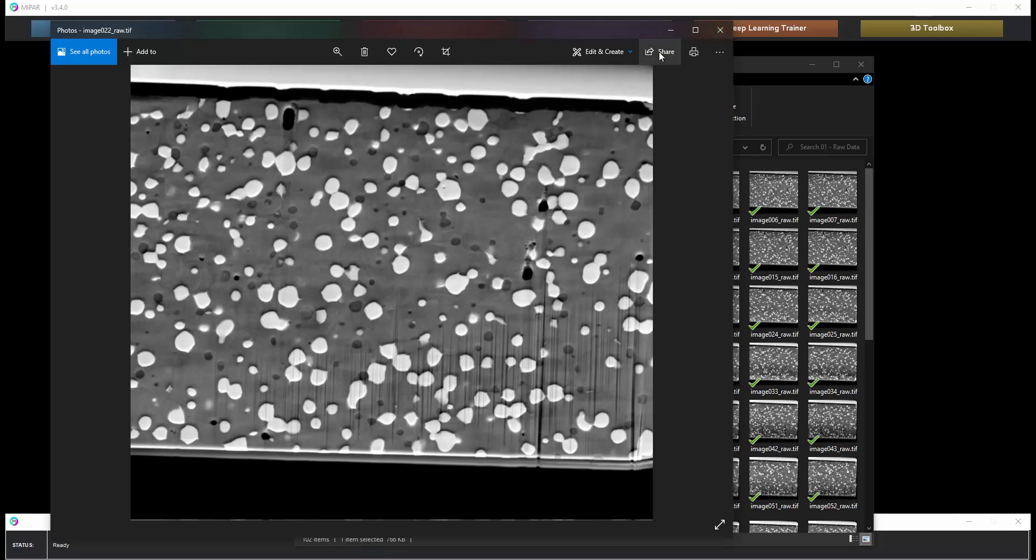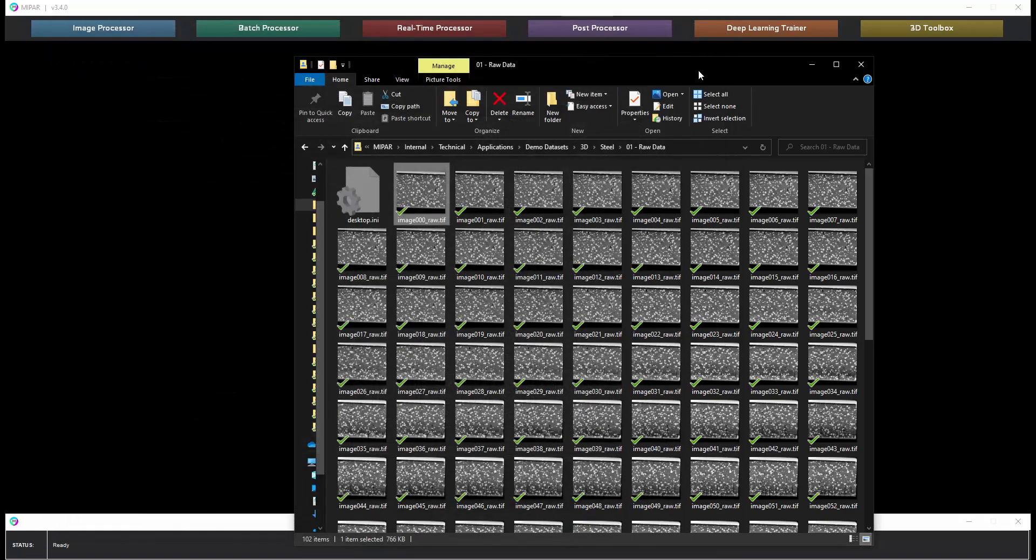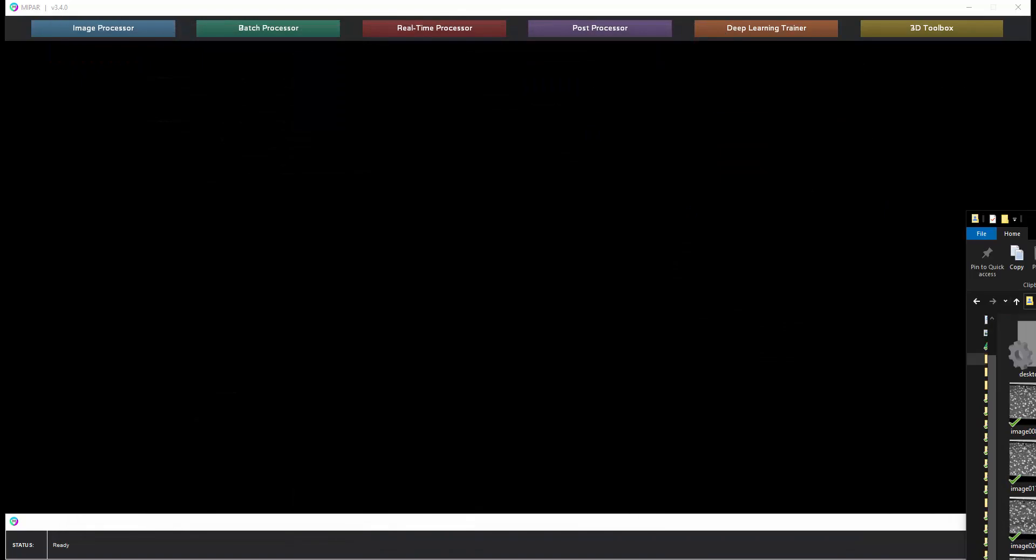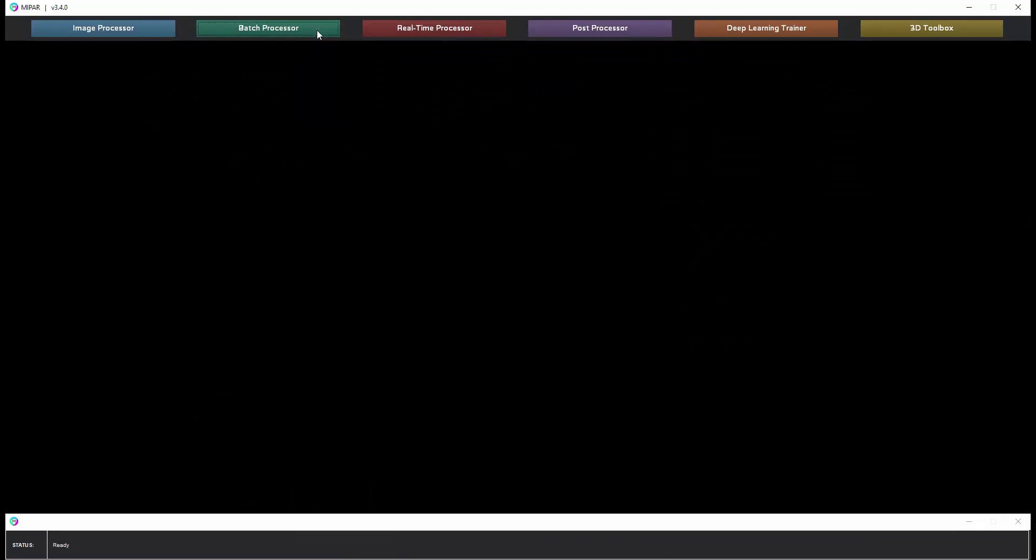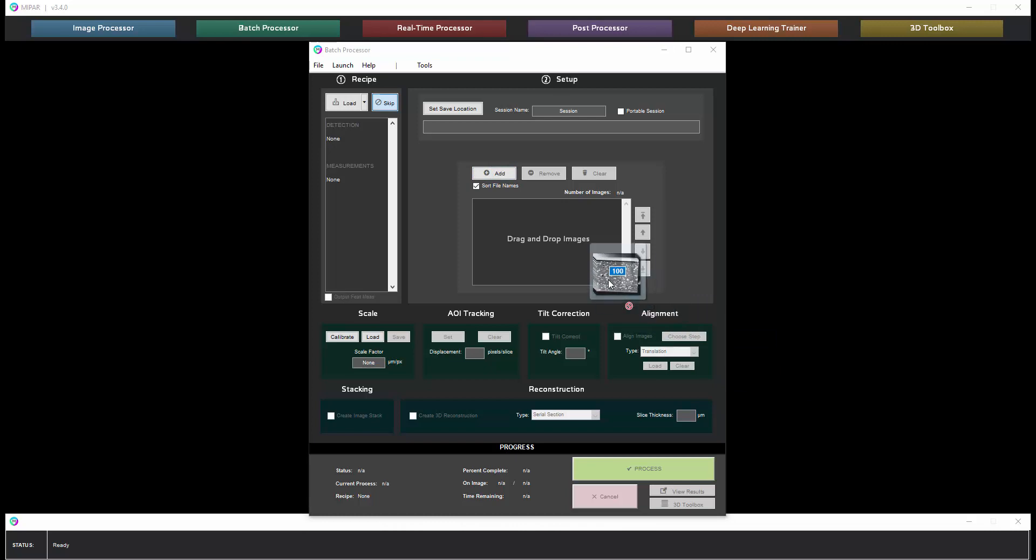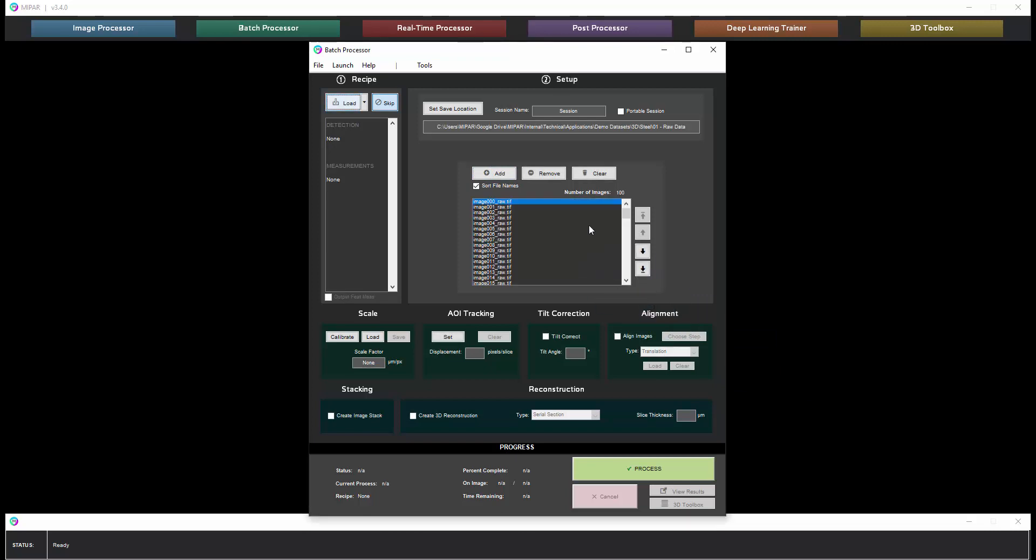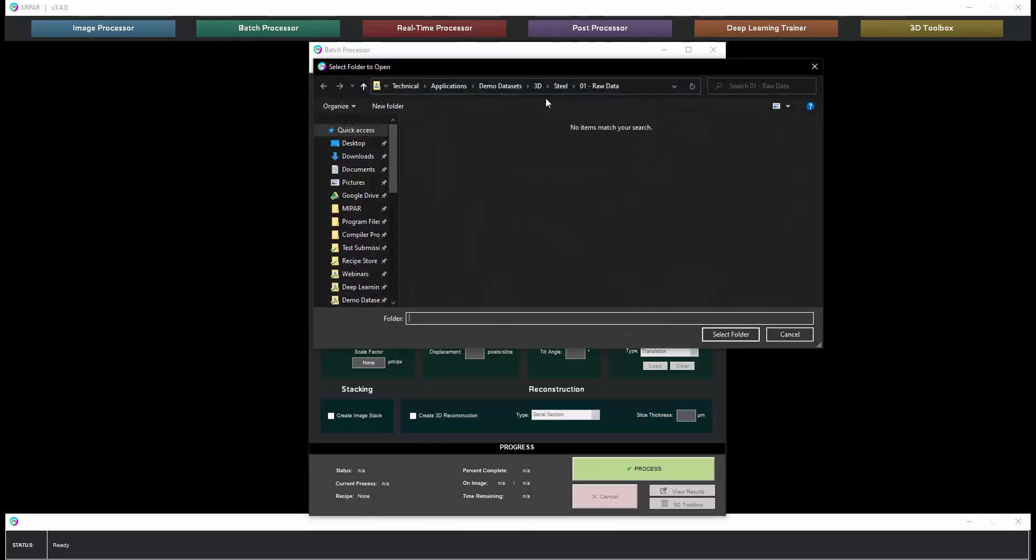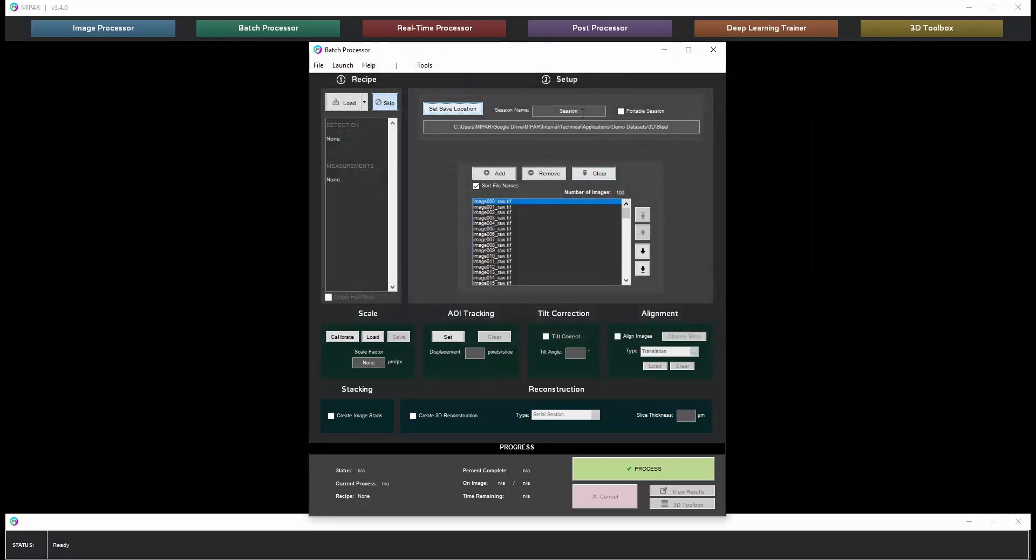So to begin we're going to start in the batch processor. We are first going to run through the data set with no recipe. We will drag in all of the raw images and we'll choose a location to output the aligned data. We'll then give that folder a name. I like to number them. Then we will choose to align the data set and create an image stack.